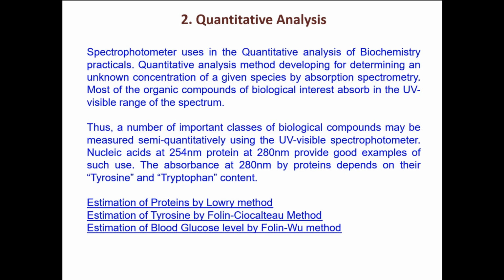Let me give you an example here. In the last classes, I told you there is a special word called blank or reference. A blank or reference is the one which holds all the reagents except the one which is our interest, right? We use that and make its absorbance 0, if you remember, right? So we make it 0, and then afterwards we use that as a reference solution.